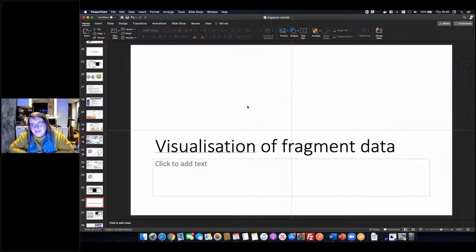Okay, that's great. And you talked about available from Enamine. Enamine has a database of, what is it, 1.3 billion structures. So do you have all of those enumerated? Something insane like that. No. So our graph network is focused on our fragment libraries. So you can sort of take a subspace of Enamine's REAL database that aligns directly to your fragment library, so that you know that if there are molecules in the wider space that aren't accessible from the starting points that we have, we can just start to ignore them.